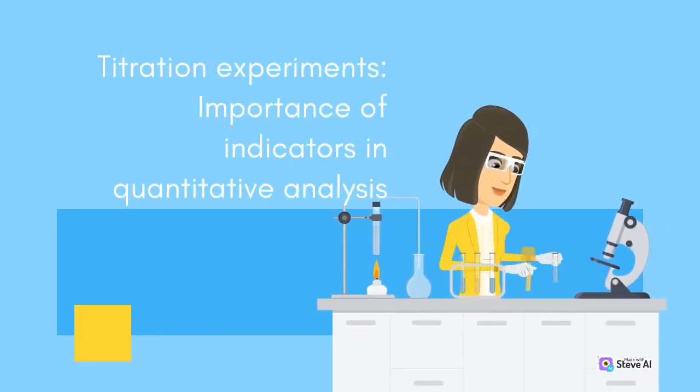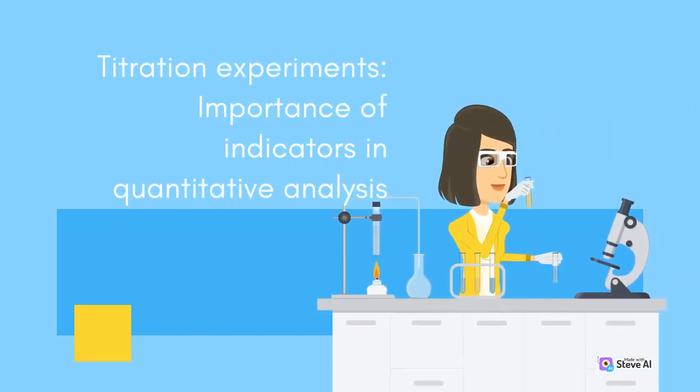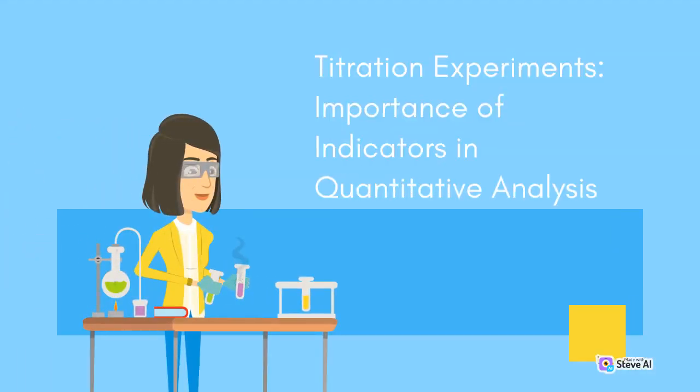Titration experiments, importance of indicators in quantitative analysis.